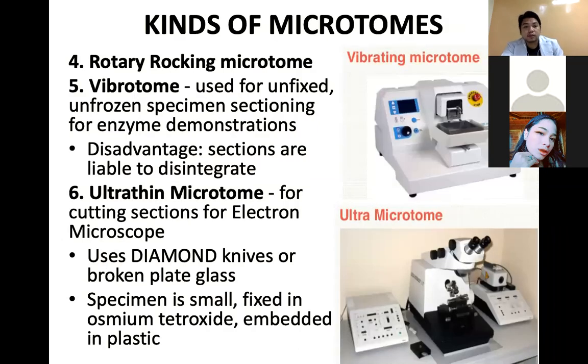We also have the rotary rocking microtome. Later on, we're going to discuss it in a separate discussion since it is the most common, routinely used microtome. Then the vibratome is used for unfixed, unfrozen specimen sections for enzyme demonstration.